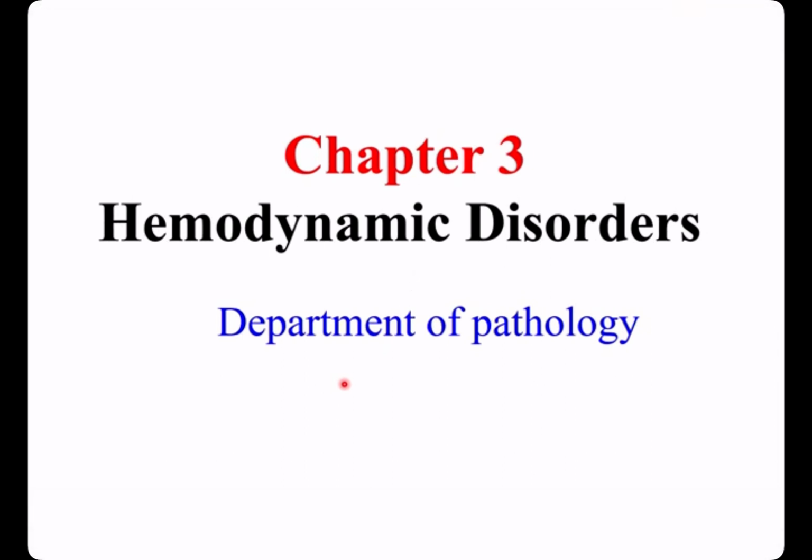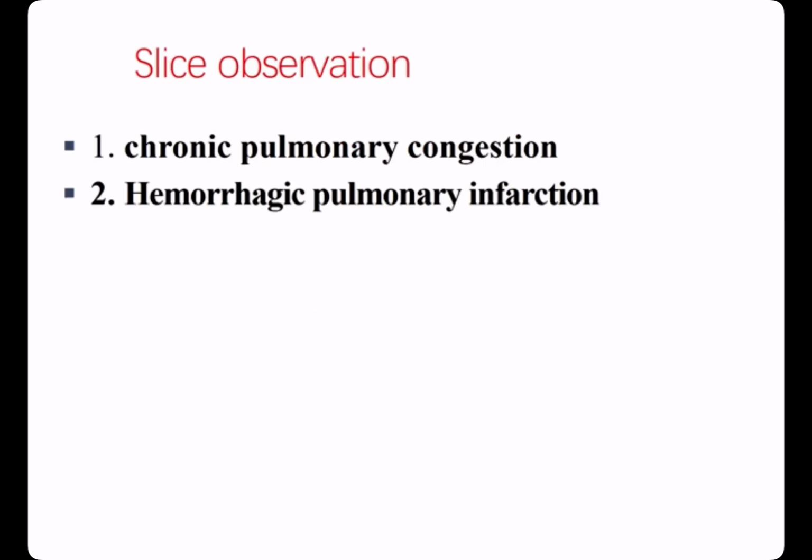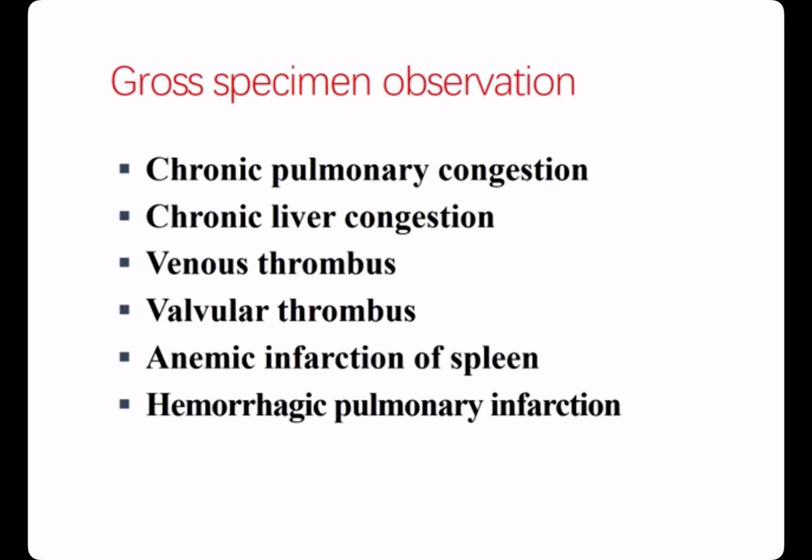Now, let's begin our lesson. Practice Chapter 3, Hemodynamic Disorder. Today, we're going to observe the two slices. Also, we will observe these gross specimens.